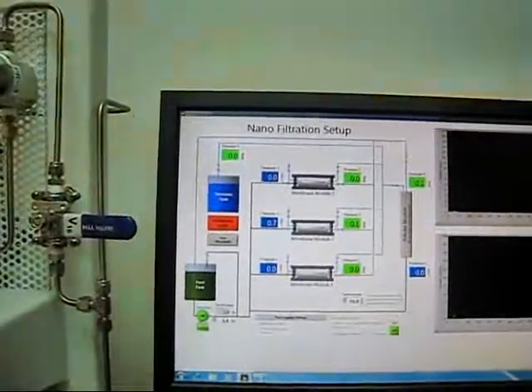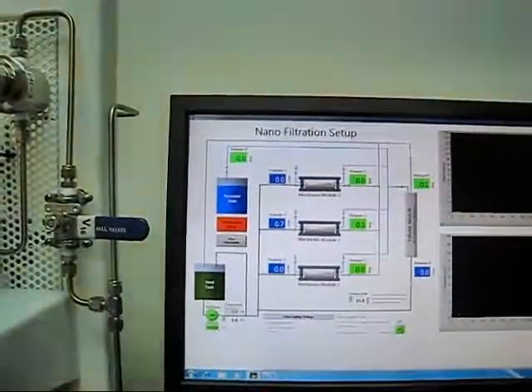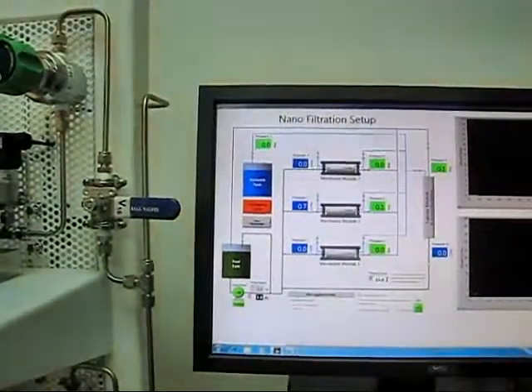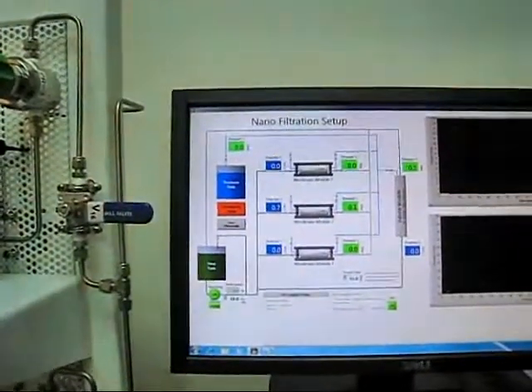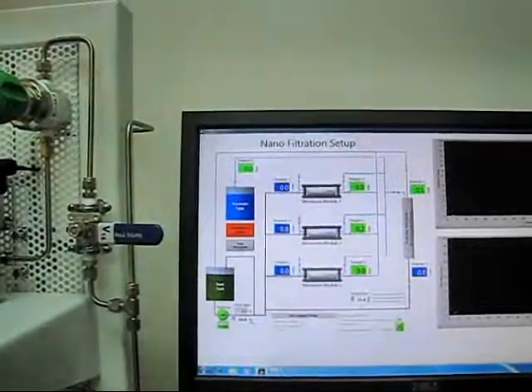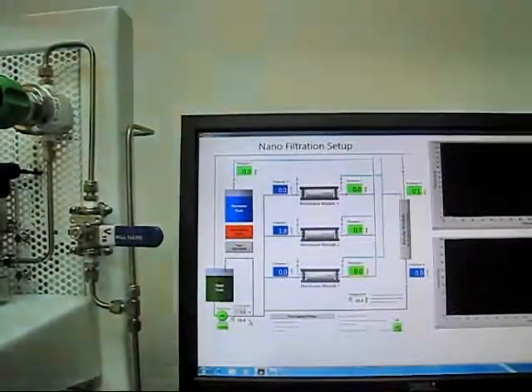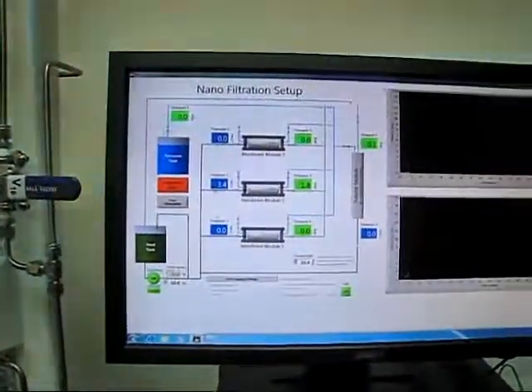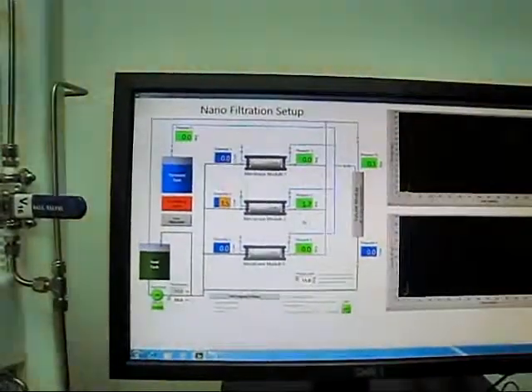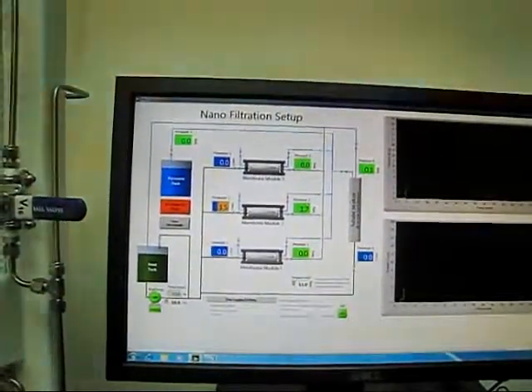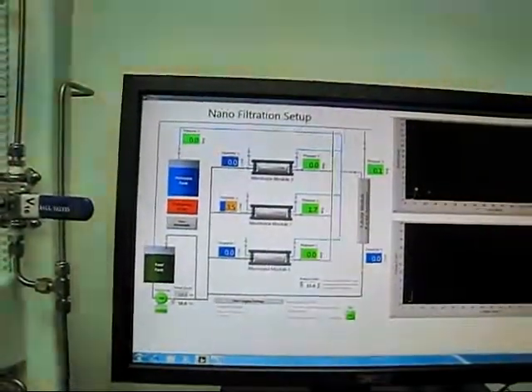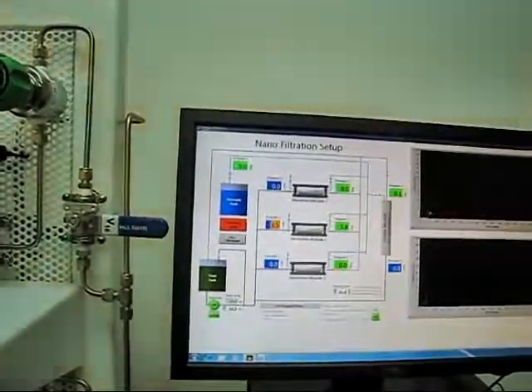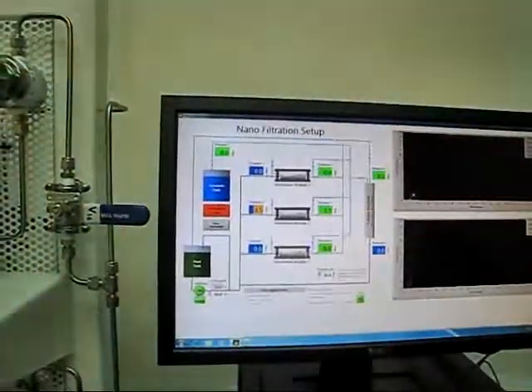I've already done that previously about 2-3 minutes ago. Now I'm going to increase the pump speed to 10 Hertz. As I increase the pump speed to 10 Hertz, you'll see that the flow is starting to increase. See the changes in the flow rate as well as the pressure. It will hit a steady value of about 3.5 liters per minute at a pressure of 1.8 bar.